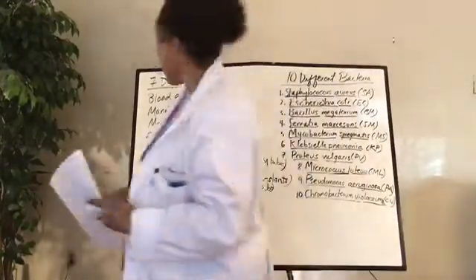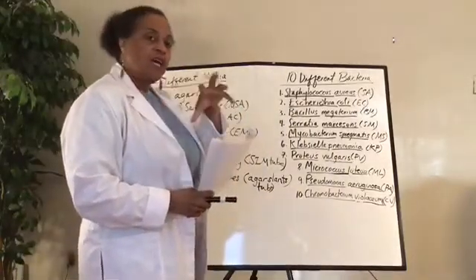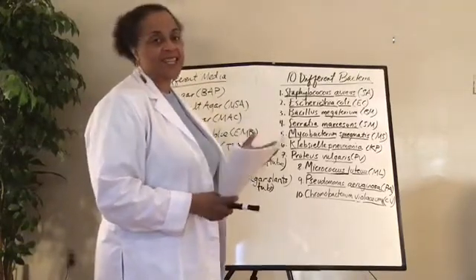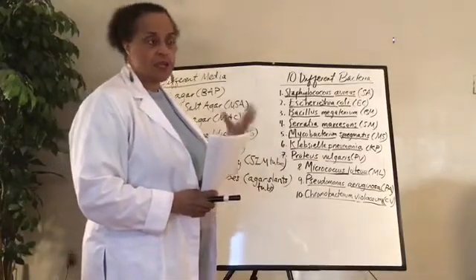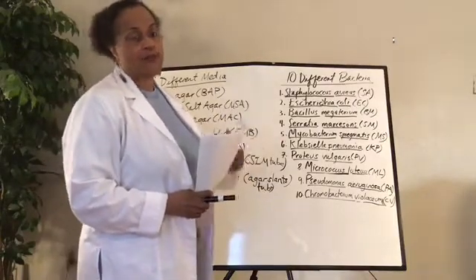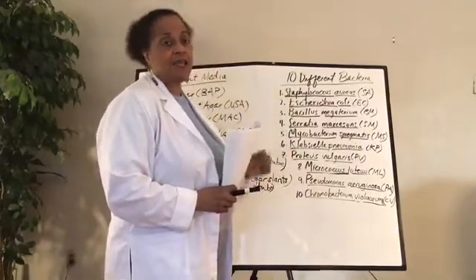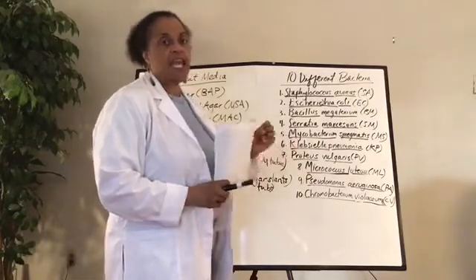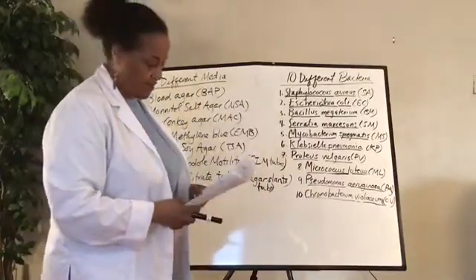When you do blood agar, for example, I want you to look for hemolysis. That's where the blood has been cleared away. Hemolysis means the blood is lysed. We talked about that a bit before. If you need to see that, turn to chapter 3 of your text, and it will give you different examples of that. We talked about hemolysis when we did streptococcus. You had alpha hemolysis, beta hemolysis, remember, and I think a gamma hemolysis. It's the way the blood clears from around that particular bacteria.